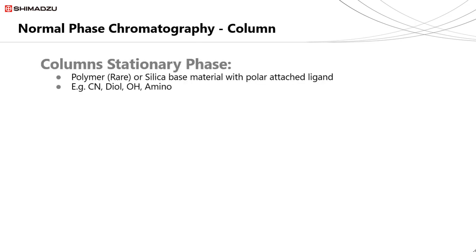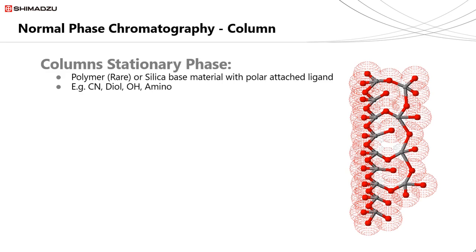Our next separation is normal phase chromatography. This is the oldest of the liquid chromatography types, used by Svet more than 100 years ago to separate colorants within plant material. Today's columns still use a silica base which can be bound to small functional groups to promote attraction.